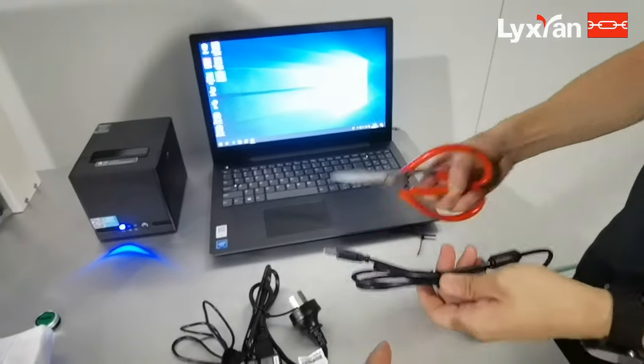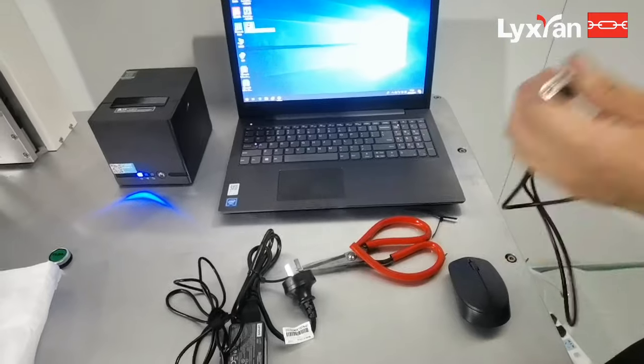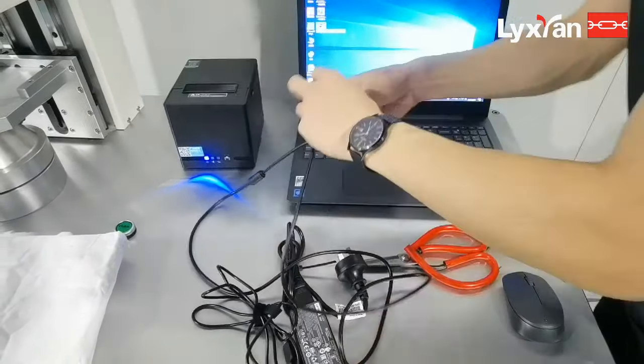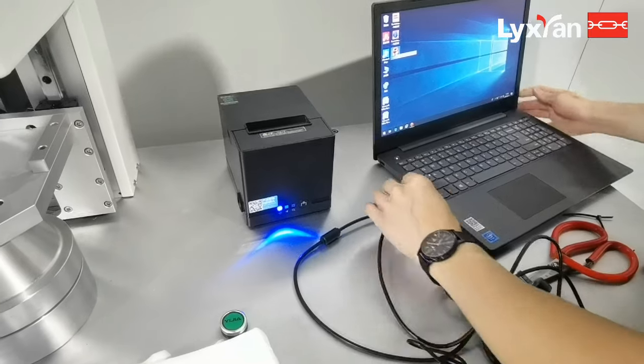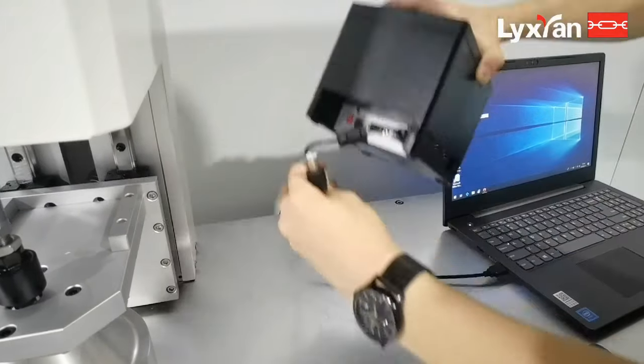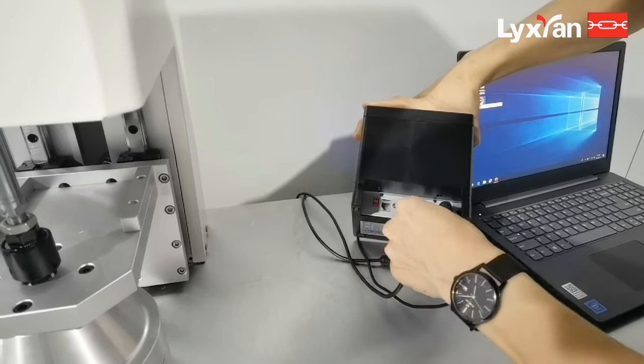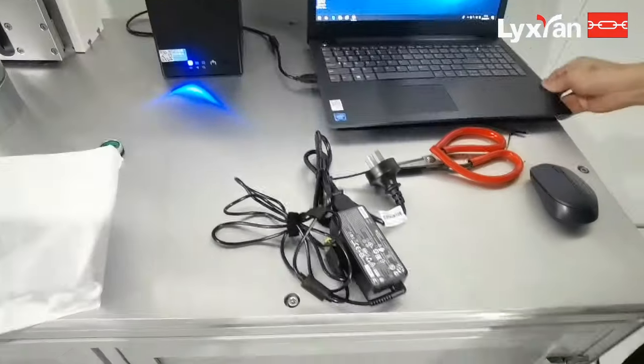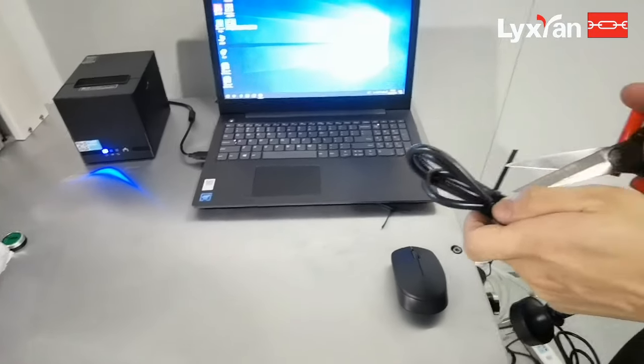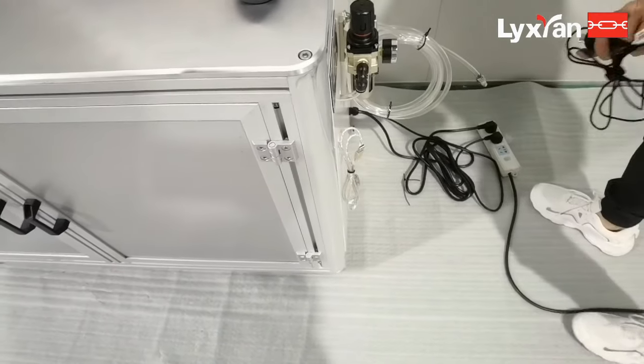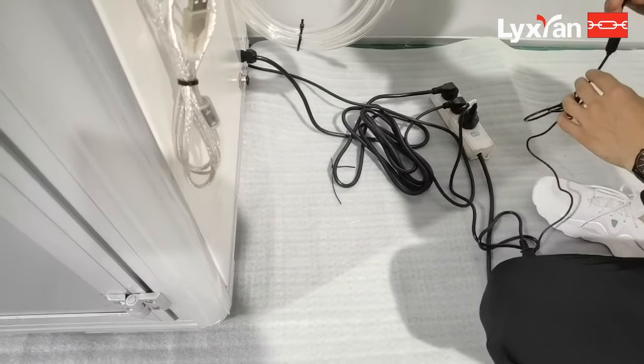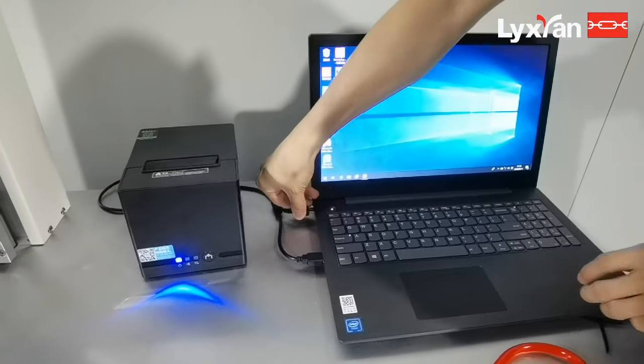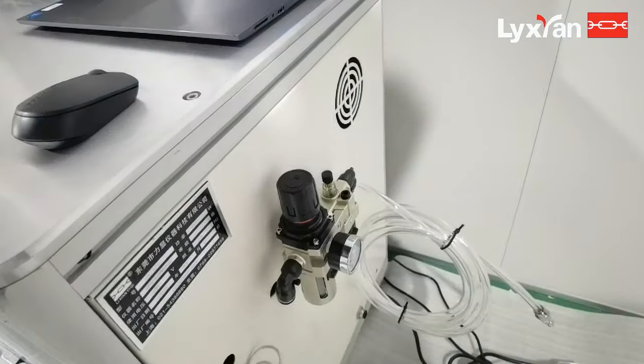And this one is for printer contact with the computer. And this one is for the computer. And then this is for the air compressor tube.